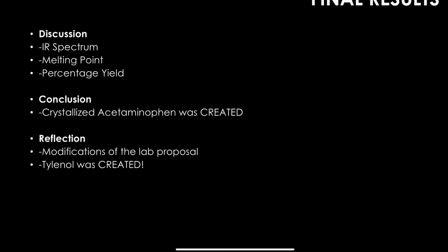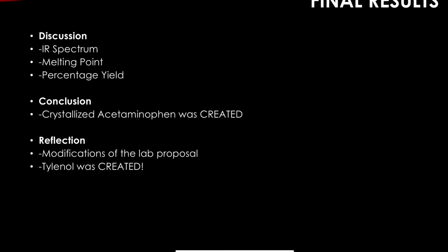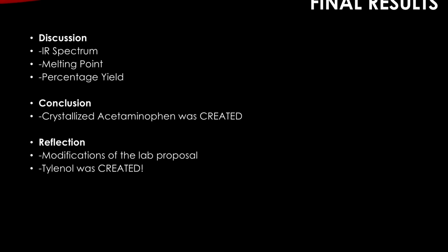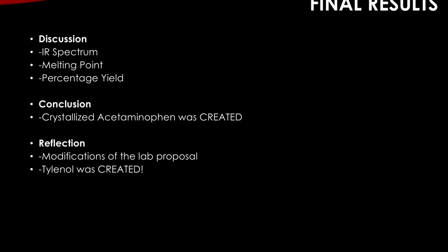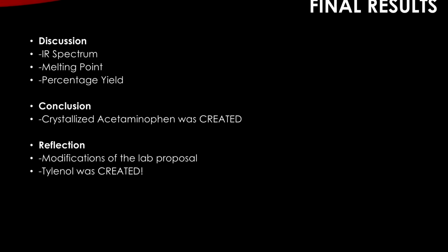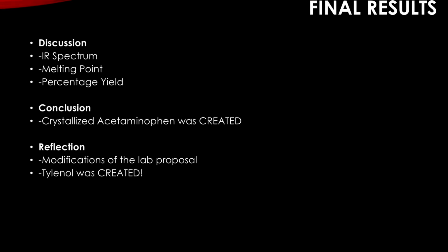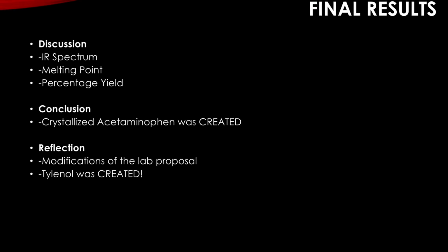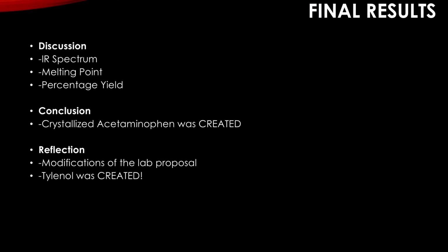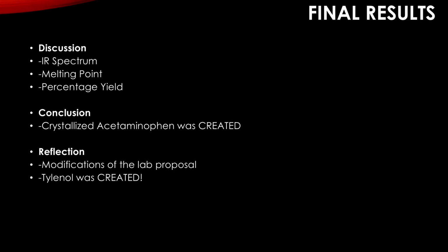For our final results, we concluded that the percent yield did not meet our expectations, only 72% out of 100, but my melting point did exceed expectations, going from 168.5 degrees to a range of 172 degrees. My IR spectrum was comparable to another source of acetaminophen graphs on PubMed, but unfortunately my percent yield error was about 28%, which can be significantly lost in crystals when transferred from the funnel after vacuum filtration.